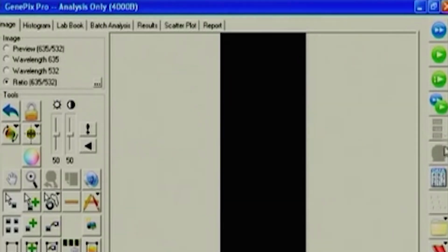You also have other buttons which will light up as and when you acquire the image, and this is for the analysis. So once the analysis is done, if you click this button, the analysis will be performed after the alignment. So this is actually the open button. This is normally your file menu where you want to open or save your images, right.